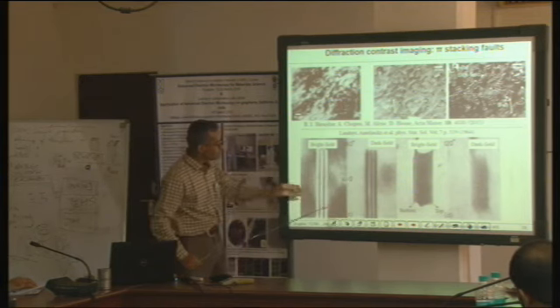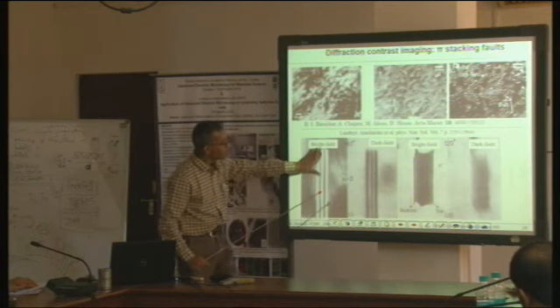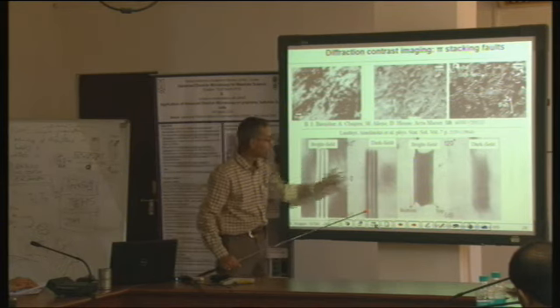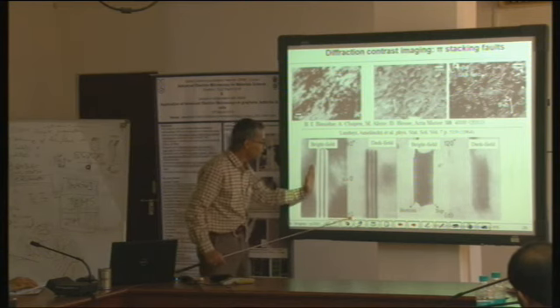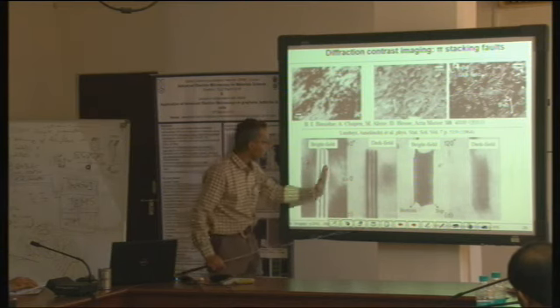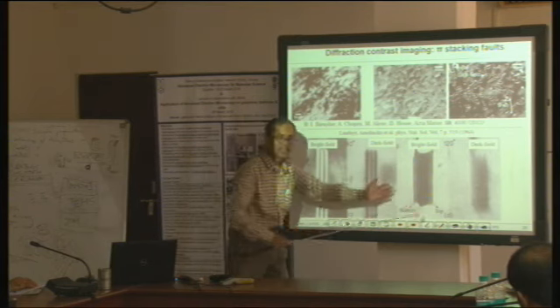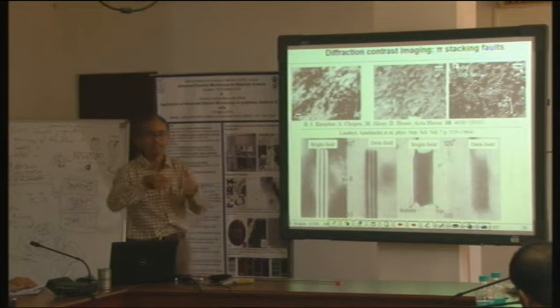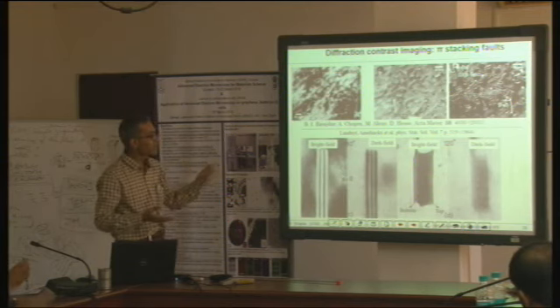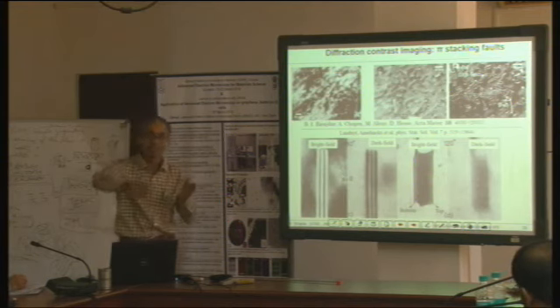So people see this bright field image of the same defect and this dark field image, and they see whether you have a complementary contrast, whether on the left side the contrast is complementary but on the right side it is the same. Depending upon that and the calculations, they have made some inferences. So with that, one is able to find out if there is a stacking fault.